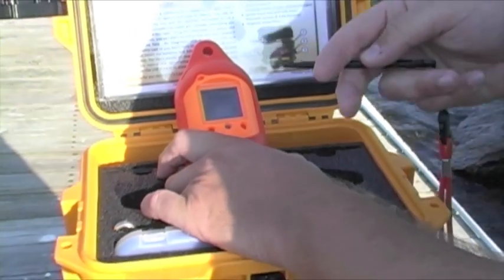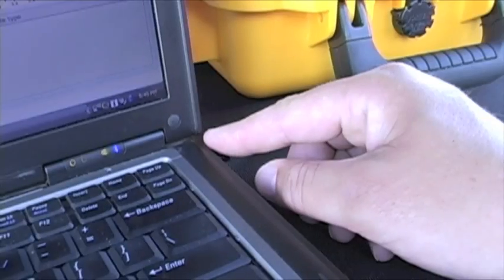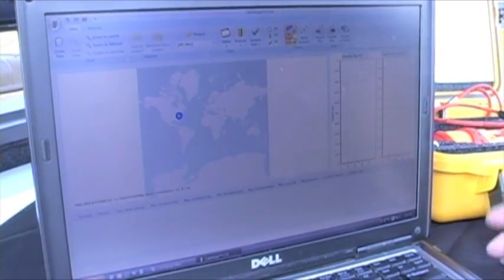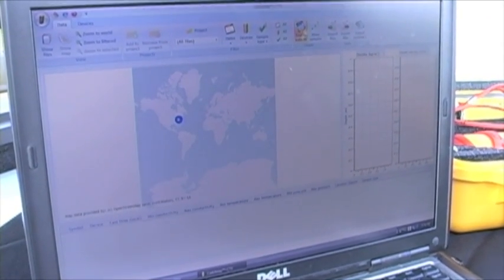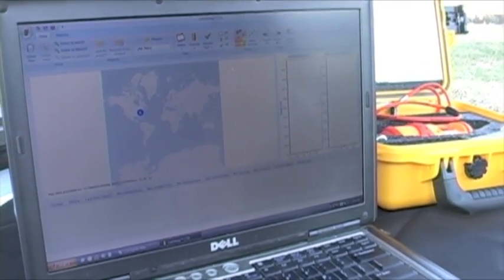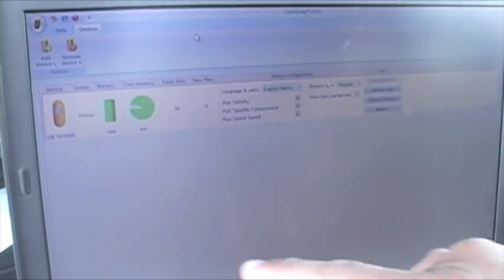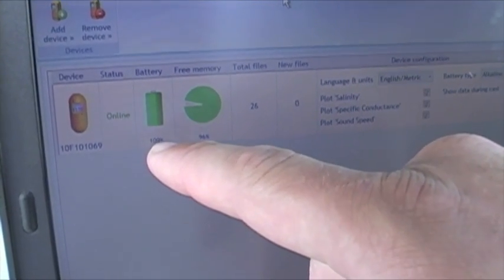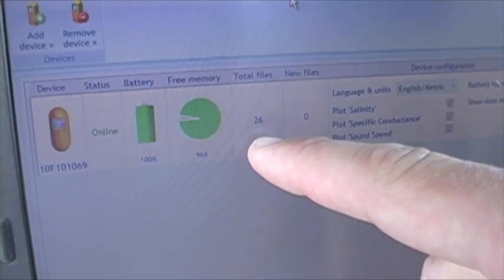So let's go over to the computer and download some of the data. We'll take a look at that cast we just saw on the screen so you can see what the software looks like. We're going to insert our USB modem — the one that came with the Castaway. It's going to load up the drivers and allow us to communicate with the Castaway and download data off it. So I have the Castaway sitting next to me — the Bluetooth range is about 100 meters. If I go over to Devices, we'll see the device up. This is the Castaway CTD, that's the serial number. You can see battery life is about 100% and memory is about 96% free. I have 26 files on here, and there are some general settings for battery type, language, etc.